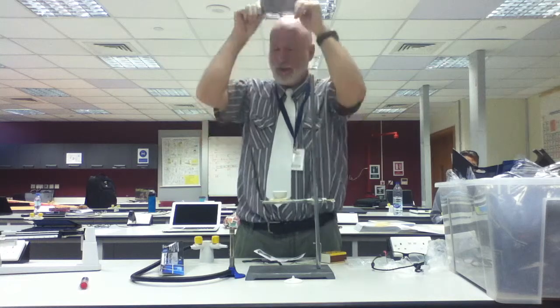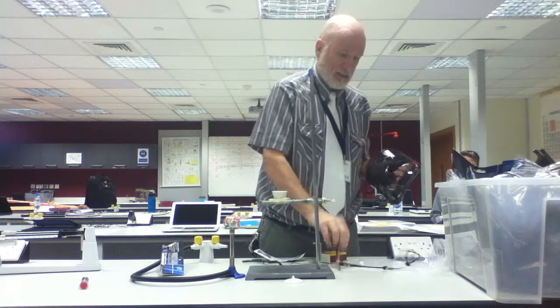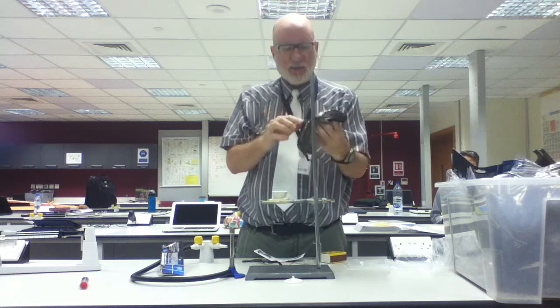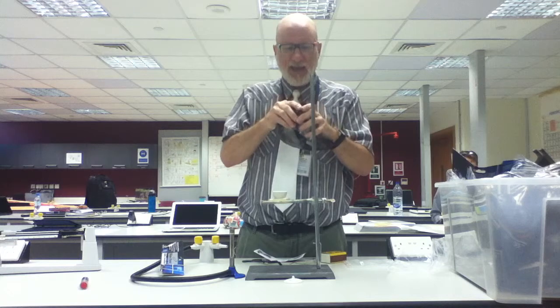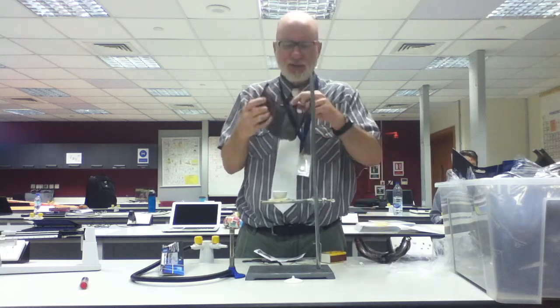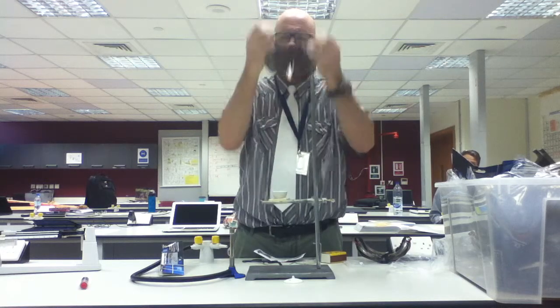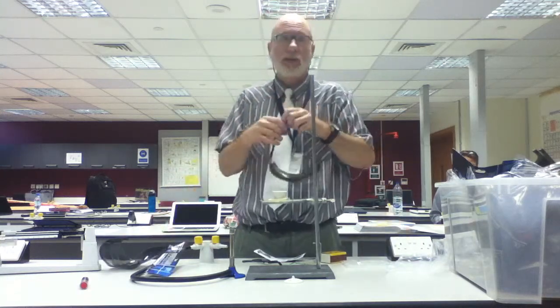Okay. So what you want to do is, because you're going to die of suffocation, you want to take these off, and you'll see that this one comes down and these go up, so it's a little weird. So you got to push it up like that, and then this comes down, and then push it up like this. Just got to wiggle it around. Don't break it. It'll come out. You can see how that's a little hook there. And then these are hooked down, and this is up. And then you have your goggles. You got to wear your goggles when you do the lab, always.